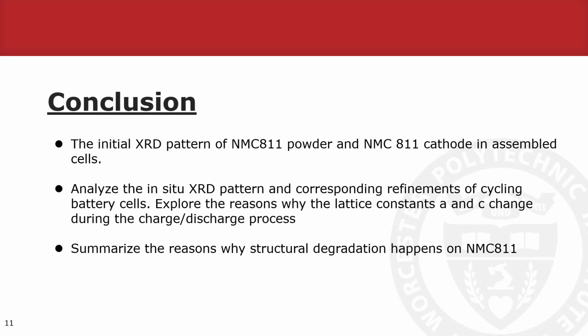In this presentation, we take NMC-811 as an example and analyze the in-situ XRD pattern and corresponding refinements of cycling battery cells. Relating the lattice parameter evolution to the charge-discharge behavior, we explore the reasons why the lattice constants A and C change in 5 stages.